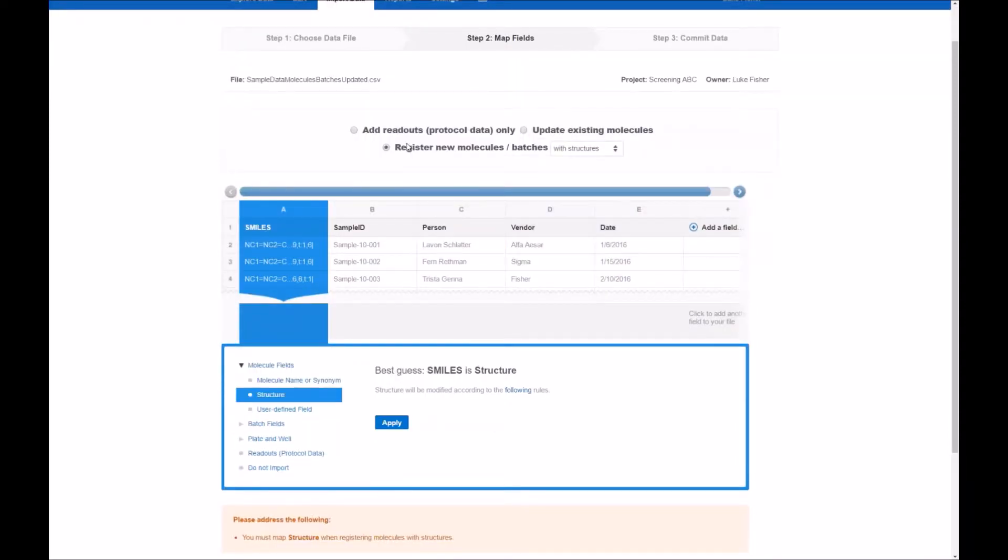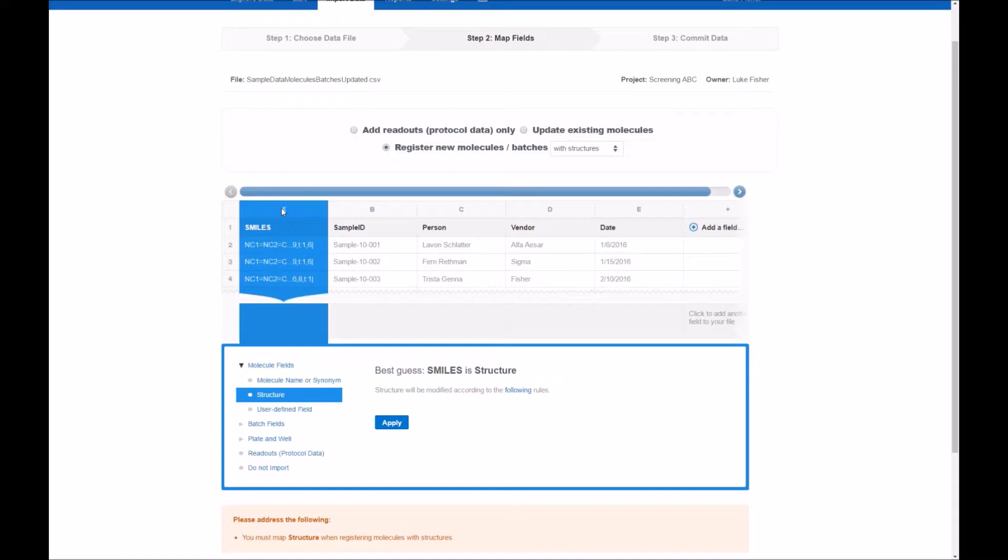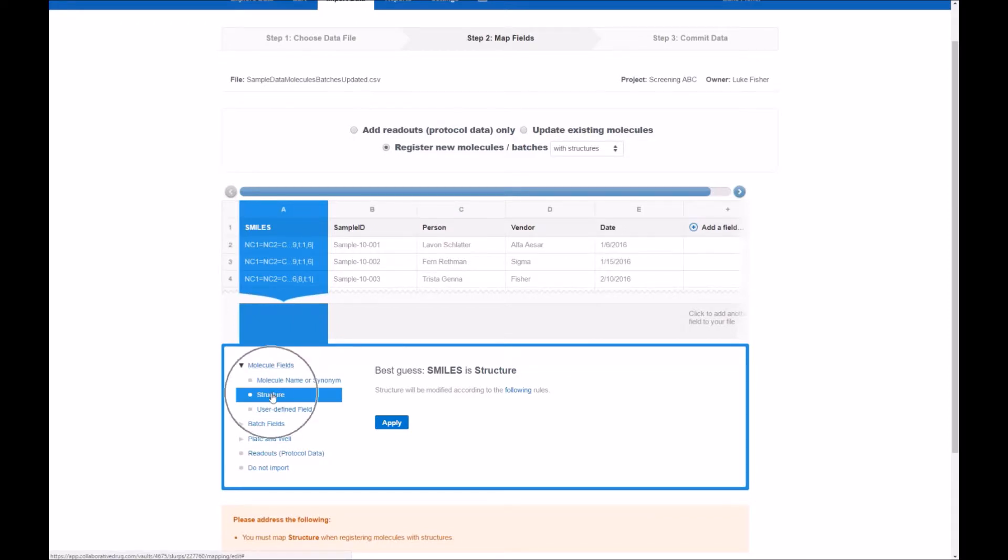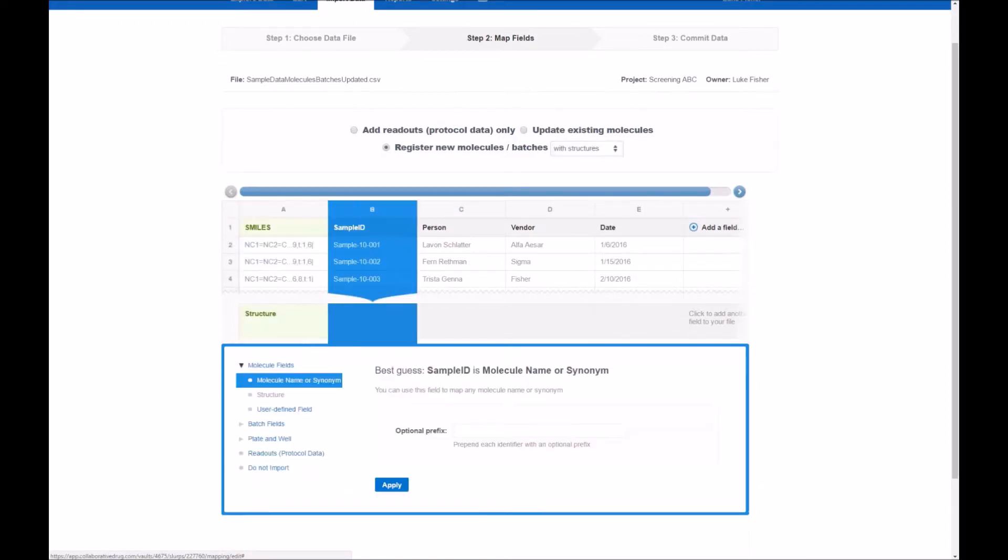So by selecting the register new molecules operation you'll see that the system was intelligent enough. It does a nice job of picking fields that make sense. It still certainly requires human intervention to review it and make sure it's mapping as you would like. So the good news is that the smile string was read in properly as the molecule field structure and I can click apply. Note that that column is now in green indicating yep we've got it mapped.